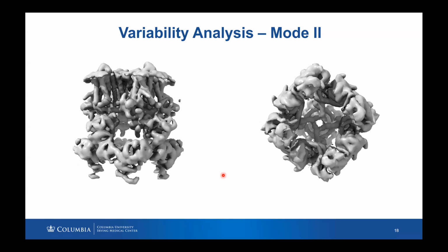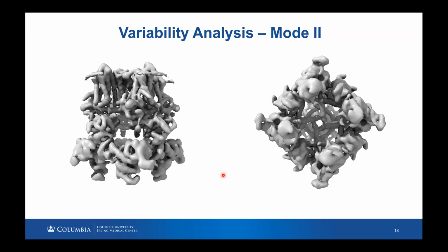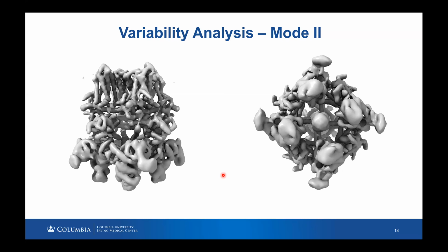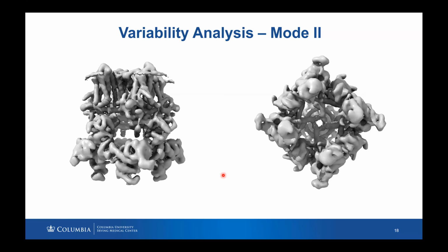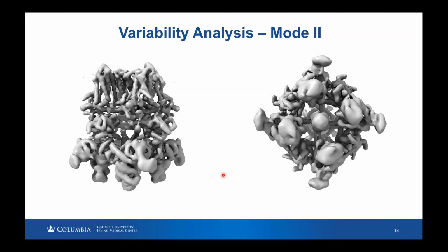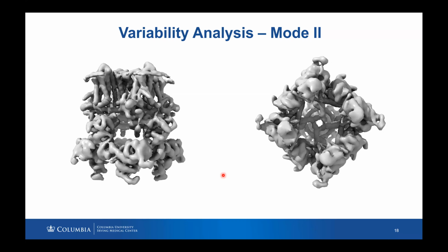We can see this during 3D classification. So I don't think this is mostly C2 symmetry. I think it's just movements and heterogeneity in each individual subunit that can be expressed in this variability analysis in CryoSPARC. I hope this answers the question, at least part of it.